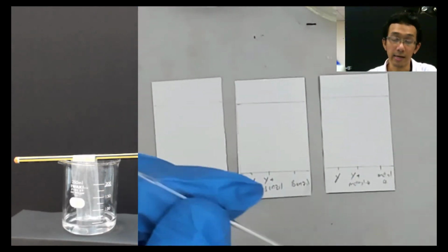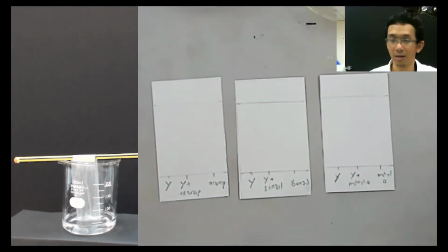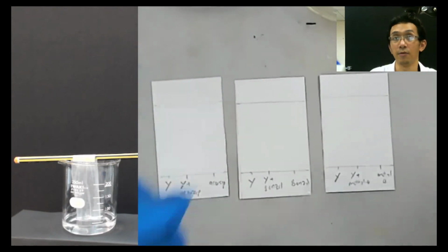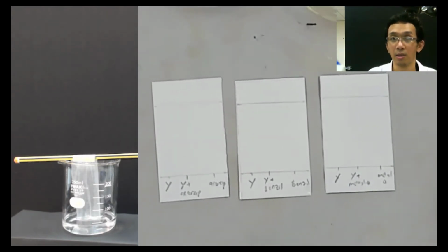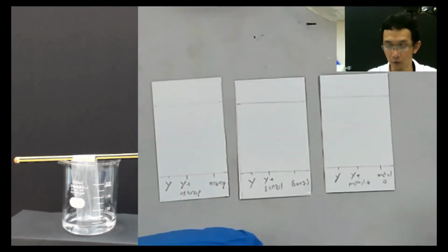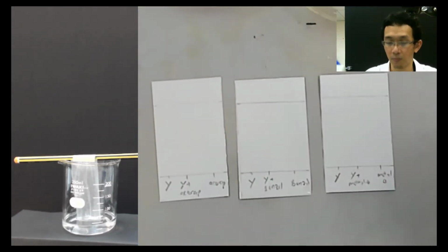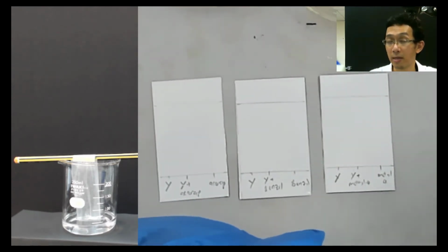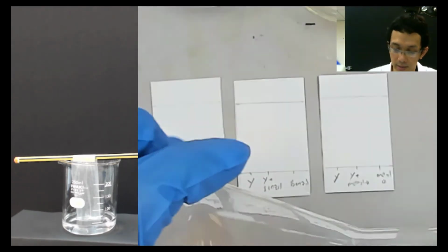In the actual lab, you need to create each spotter and so on, so it will take a longer time than this. Even though you think this is long, because you just watch it in front of me. But if you try to do it, it will take quite some time because you need to be careful not to take a lot here. You need to prepare this, need to label everything. So in an actual lab, it normally takes longer than this.